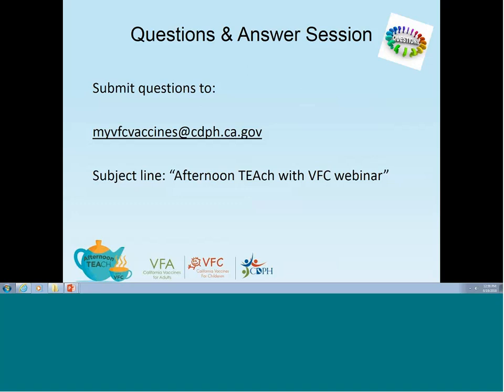And this is an interesting scenario on this device. It's very particular to one device. This is a program dealing with many providers across the state. We have not heard that occurring on other devices. So I think that would be a consideration for your practice. And then I think plugging in the devices on power strips. That was one explanation that we heard, but it doesn't sound like a real explanation.